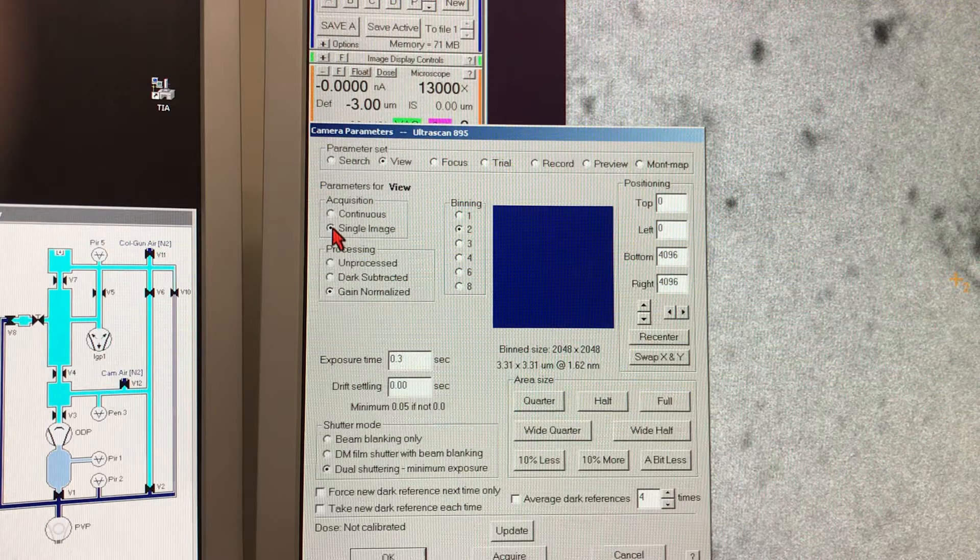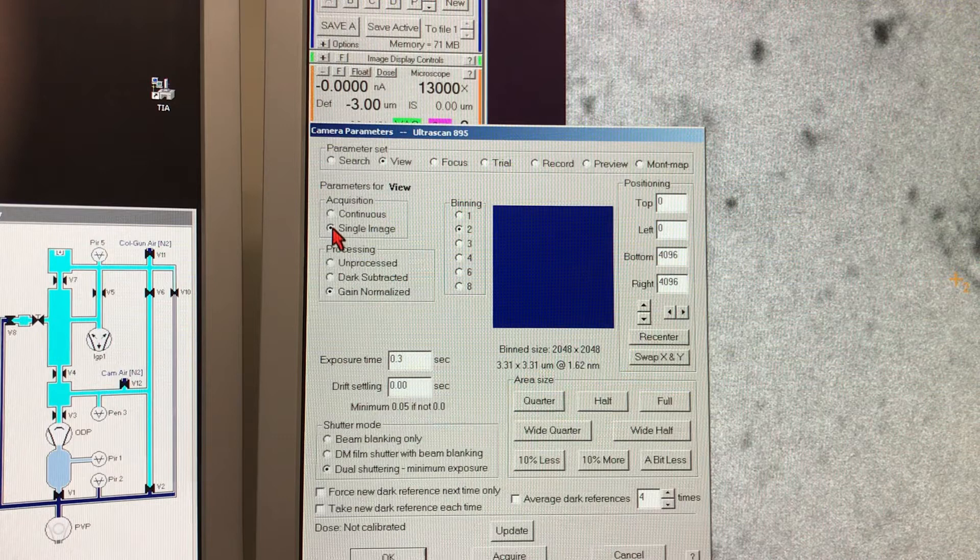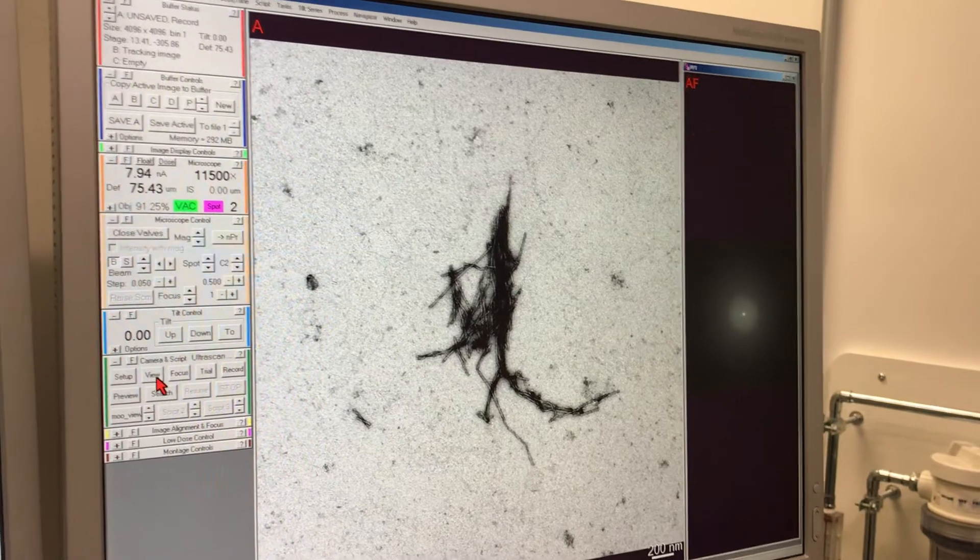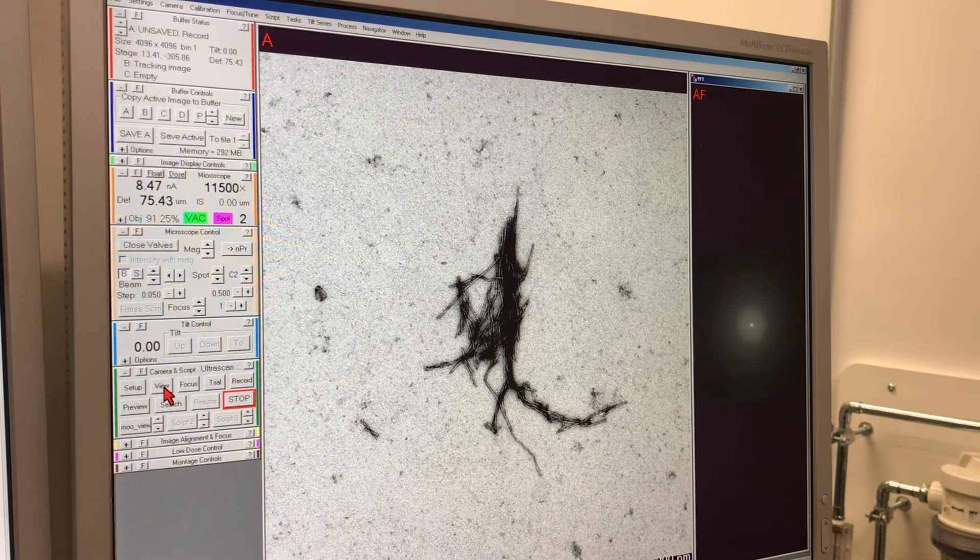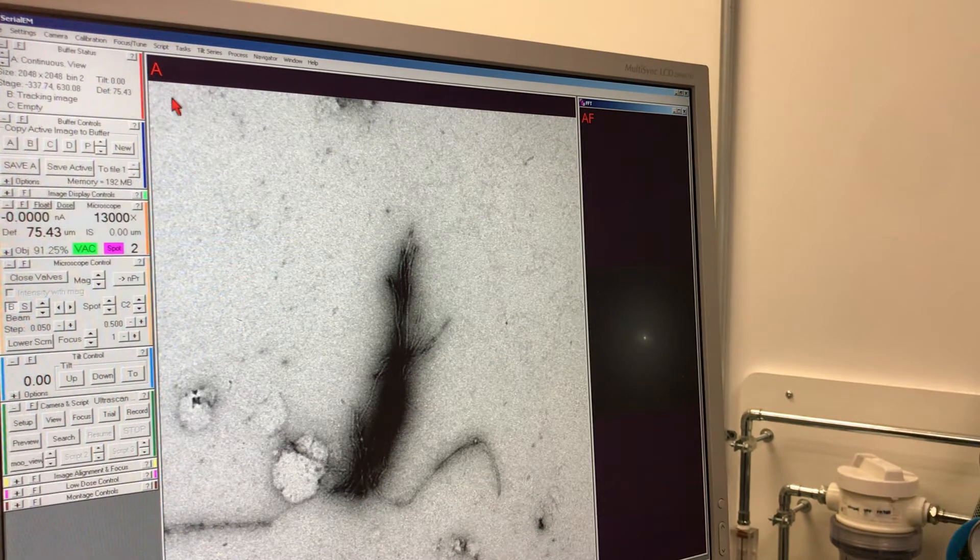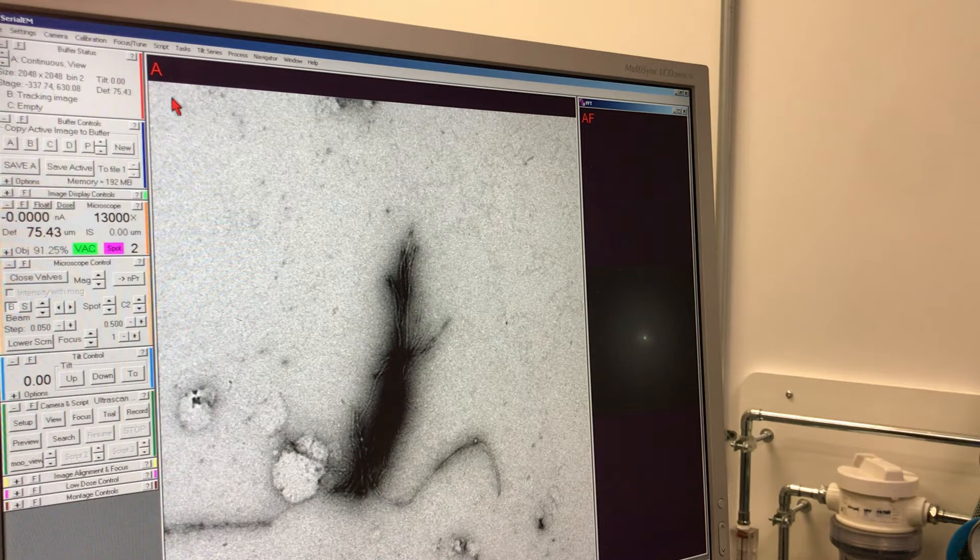We can now click OK and then press the View button on the camera and script section of the SerialEM software on the right-hand side. This basically gives us an image of the position that we were interested in.